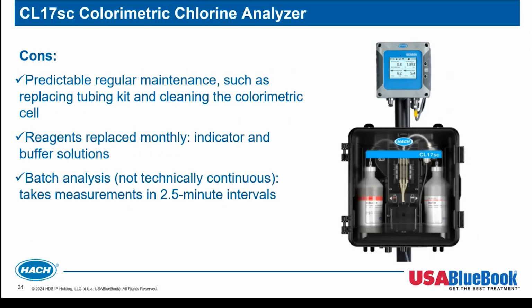So some of the cons might be that this does require some maintenance. Again, if you compare this to our legacy instruments, the maintenance is miles ahead improved compared to the legacy instrument, but we do have to replace that tubing kit about twice a year, as well as make sure that the colorimeter cell stays clean.